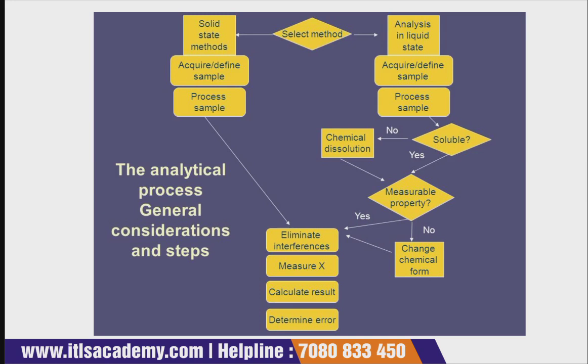Okay, a similar case is with the liquid state also. You have to define or choose the sample, then you have to process the sample. Since it's a liquid, you have to see whether it's soluble. If it's soluble, then you have to measure the property. If it is not soluble, then you have to do the chemical dissolution. Both ways, you have to measure the property.